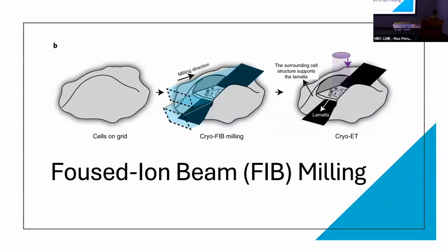So the next big one is the focused ion beam. As I told you, focused ion beam is one of the techniques to cut big tissue or cells into thinner ones. And tomography is how you take the picture. You turn the goniometer to take pictures, like when you go to do your CT scan in hospital, or MRI, you just turn the camera.